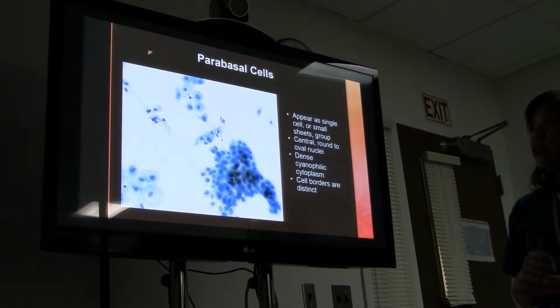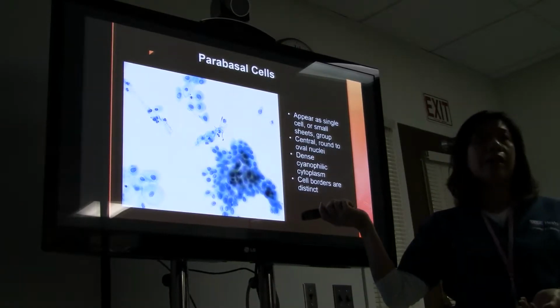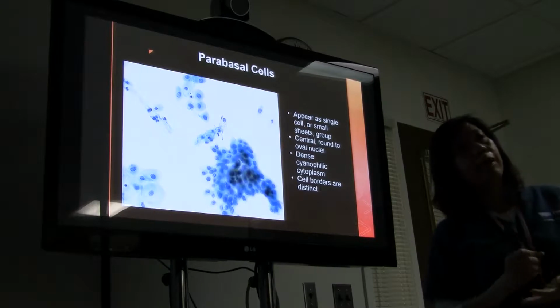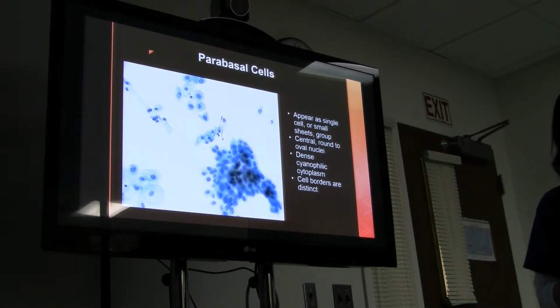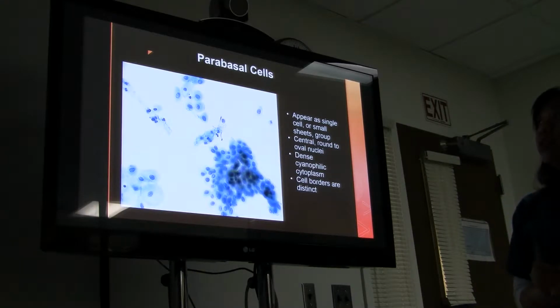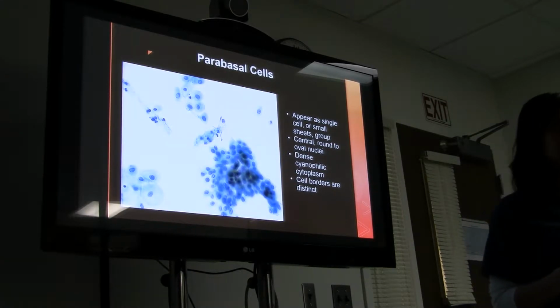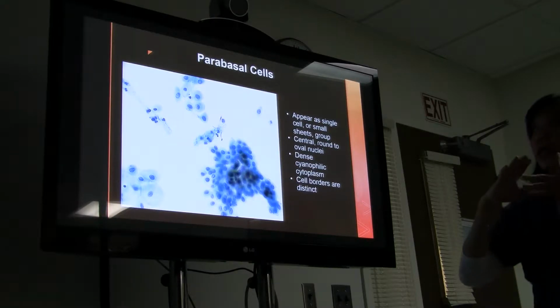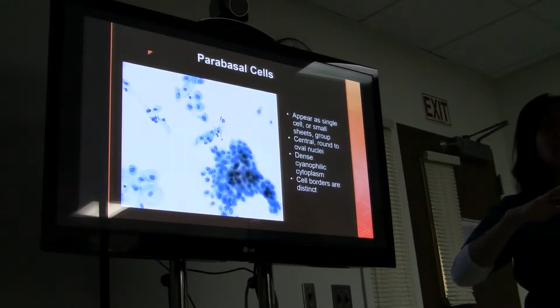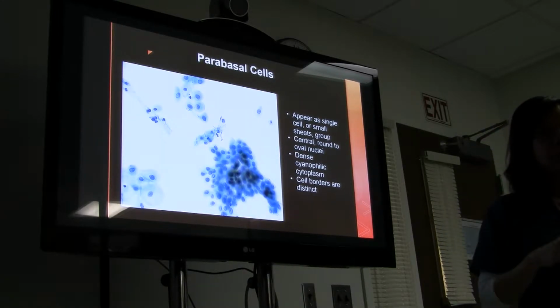The advantage of doing that is because we use this kind of stain that's called the Pap stain. Remember Dr. Papanicolaou? We talked about that in our history of cytology. He invented this particular kind of stain that we call Pap stain to stain the cells, so that you could have this kind of transparent look. That's why when it's multiple layers, you could see through the cells with different layers.